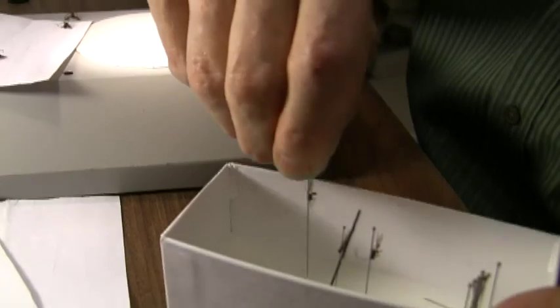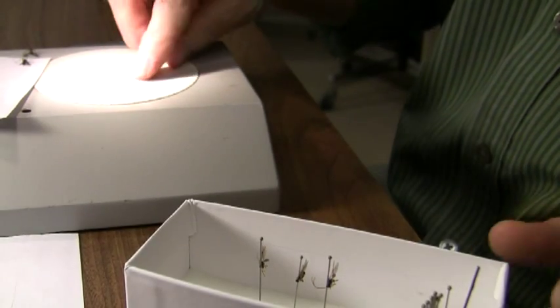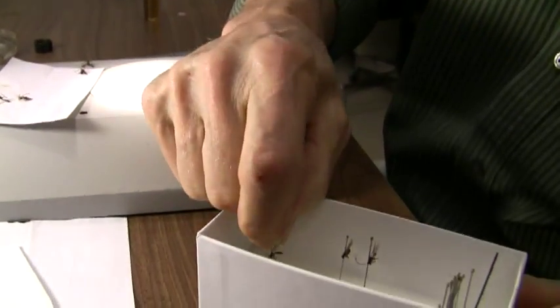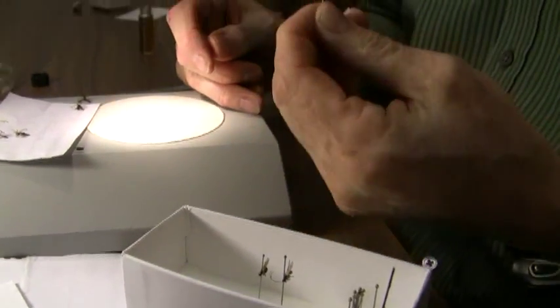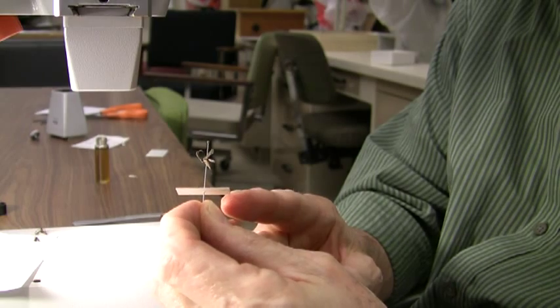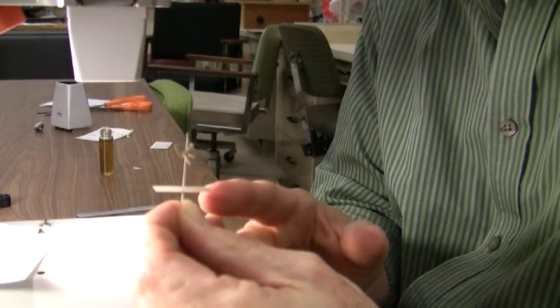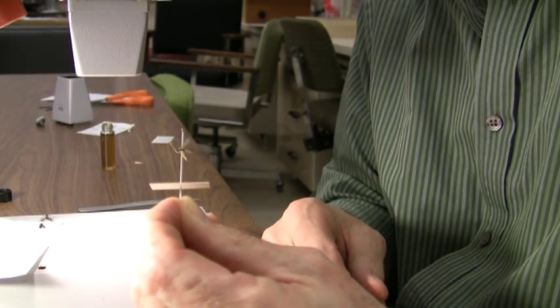Okay, and then of course the last thing that we need to do, as with all specimens, is to add labels to them. And again, to add the labels, simply center the insect and pin unit over the label, and put it at the appropriate height. And so here we have a perfectly good ichneumon specimen glued to the side of the pin. And this, I think, will be an easy way for you to process the middle-sized specimens that you need to do for today. Okay, have at it.